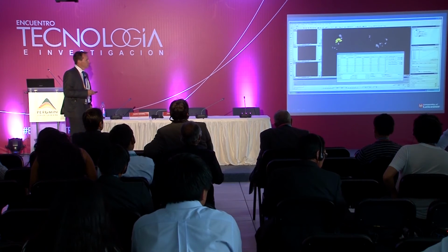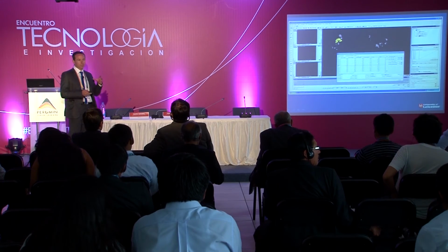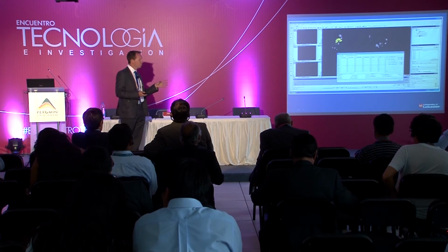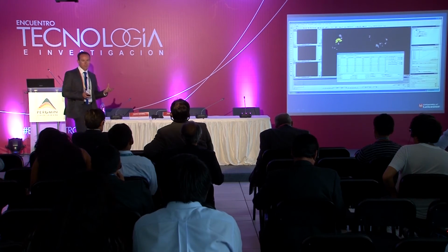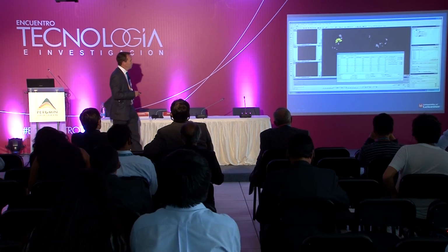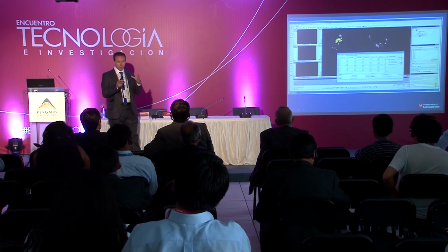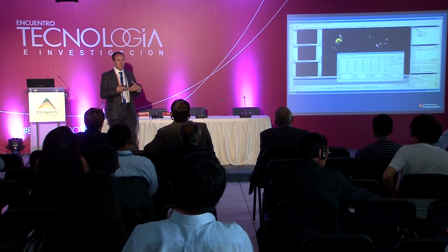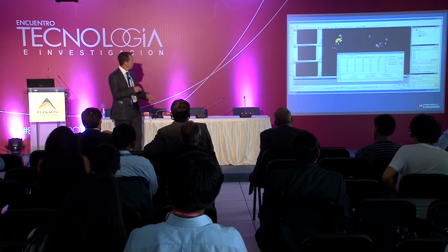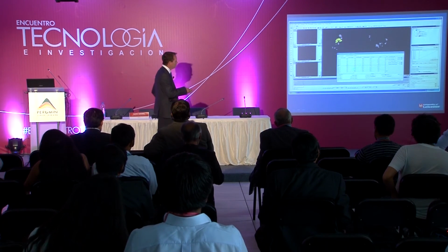So, for example, if you have a sample of a very simple quartz vein system with gold in it, and you know the density of the gold or electrum that's in there, you know the volume of the sample, you can take away, isolate the volume of gold in there, and this will give you total volumes.